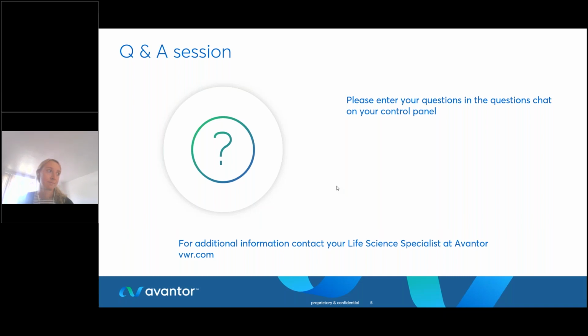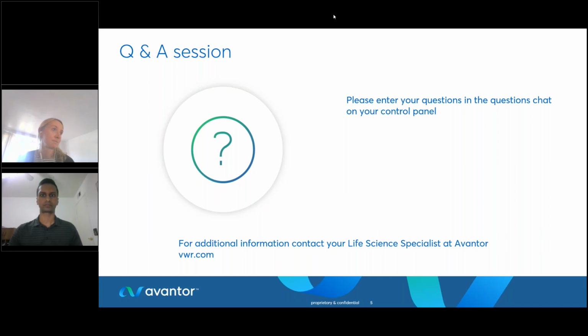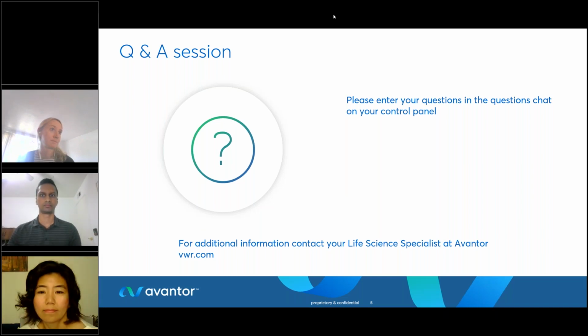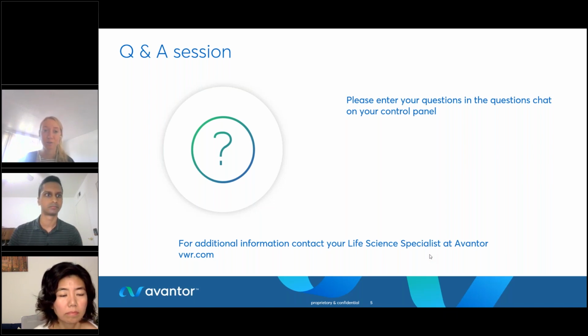Maybe we can begin with one of the first questions that came in. Is the E. coli genome sequence included in the software, or does it need to be provided by the user? I'll pass that to you, Sarah. So it's not included in the analysis software. You have to input a host reference via the host reference parameter for whatever host reference you used for your workflow.